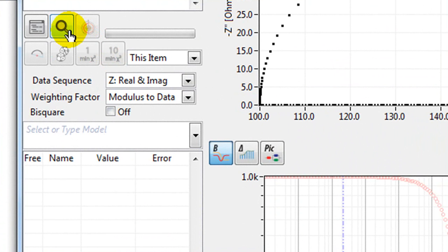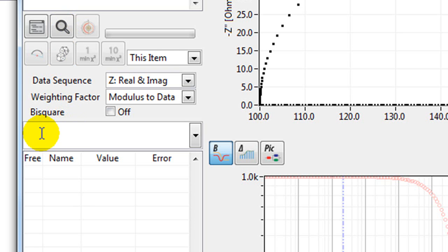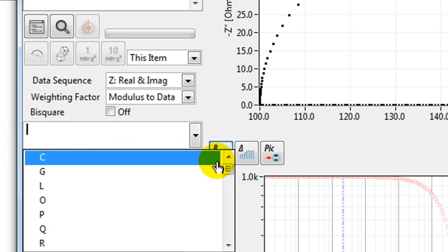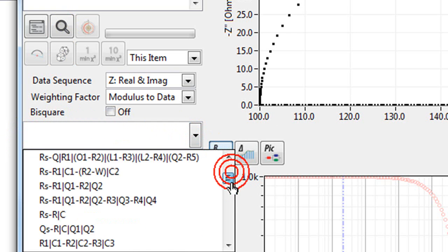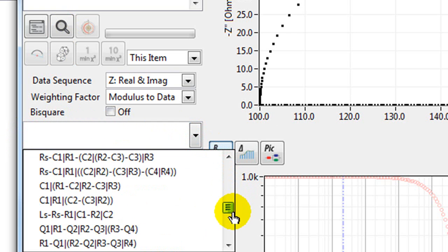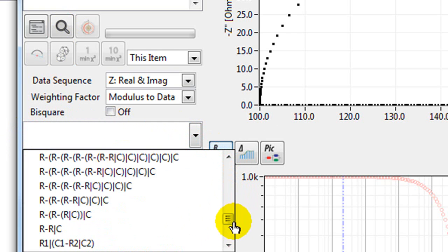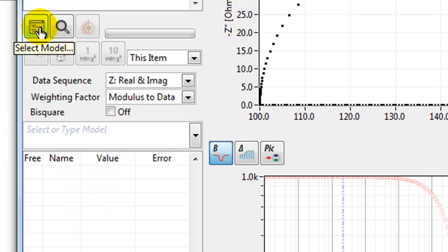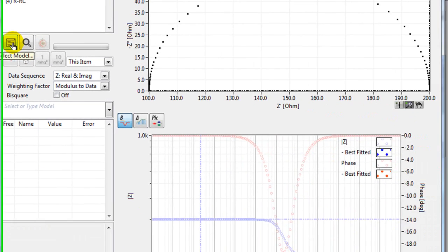If you do know what model to use, there are different ways of entering that model. You can start typing your model in here. Otherwise you can use the drop down list. There's a list of models in here. Or you can click this button, the select model.